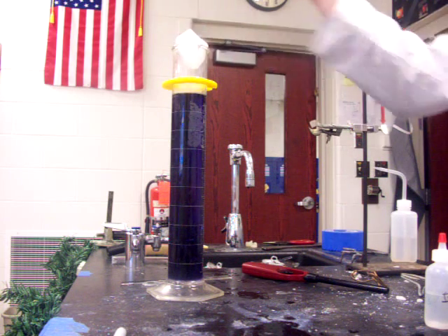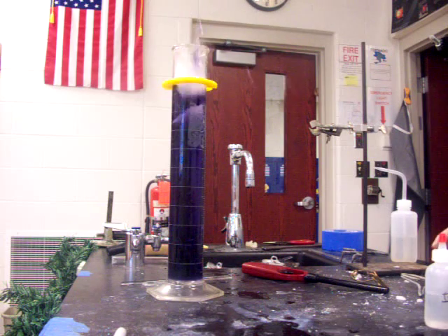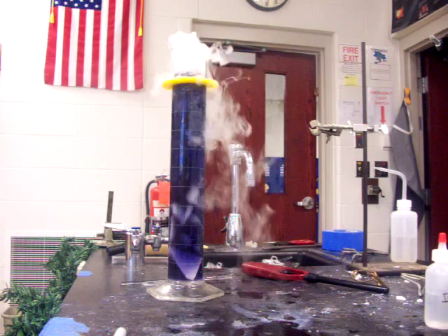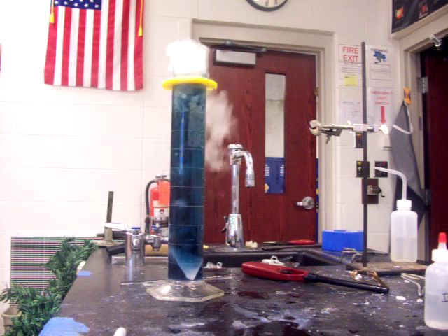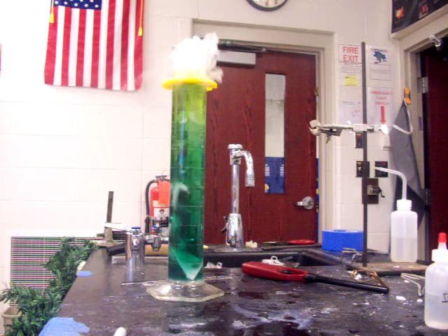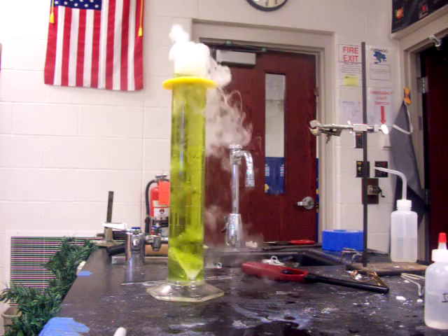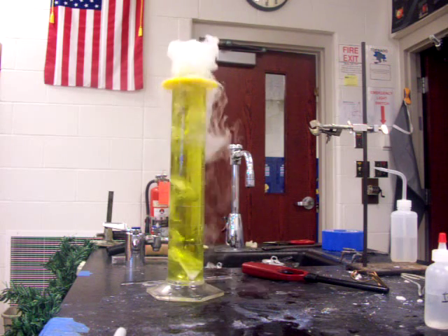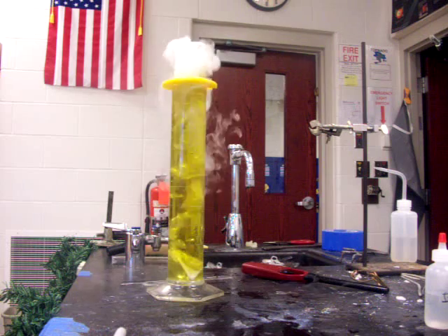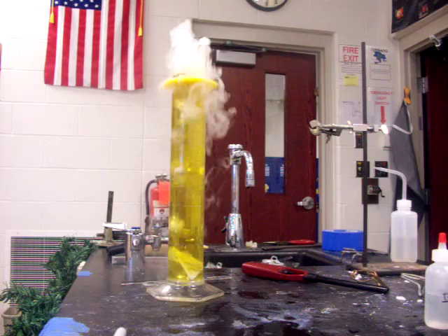So here we go. Too big. It won't go very acidic because carbonic acid is a weak acid.